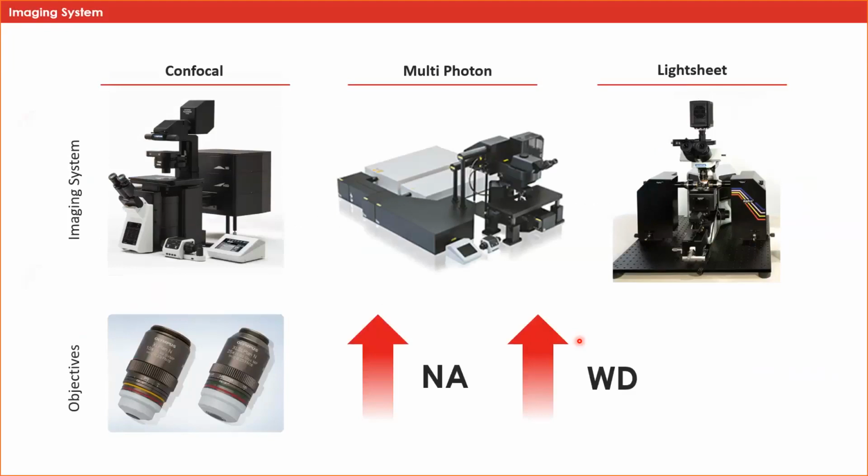Does it mean that you can't obtain these 3D images? It does mean that you will need to make arrangements to access somebody else's or even perhaps purchase a system that is capable of this. Each of these three systems has its pluses and minuses with regards to imaging depth, resolution, and scanning time. Gulpreet will provide more detail about the different systems a little later.